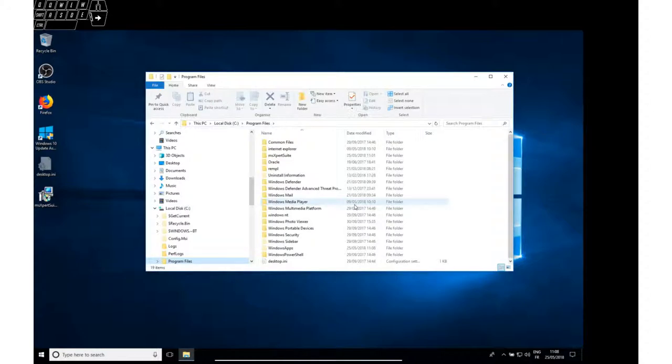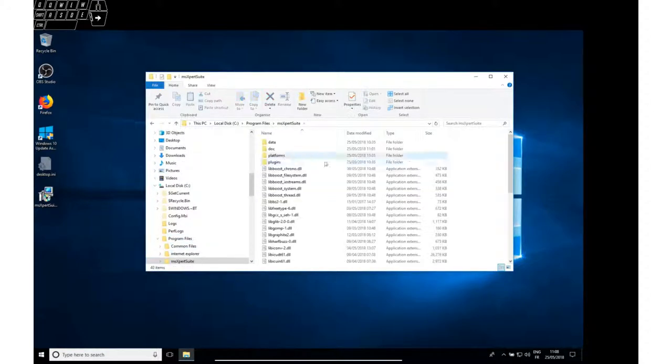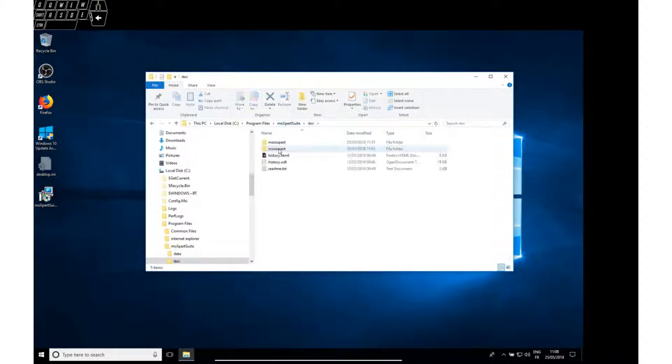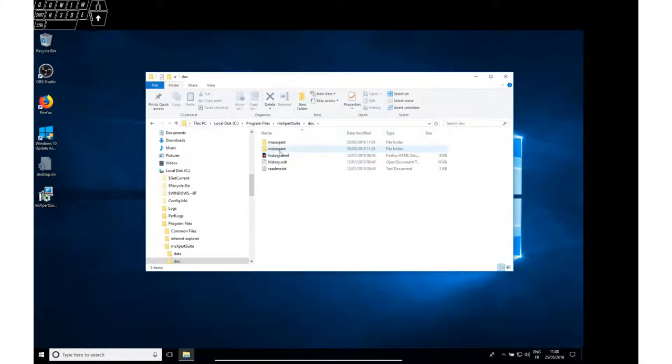Now that the software has been installed, let's check what documentation is provided. As you can see in the MS Expert Suite directory, there's a subdirectory doc in which two subdirectories are containing the documentation.